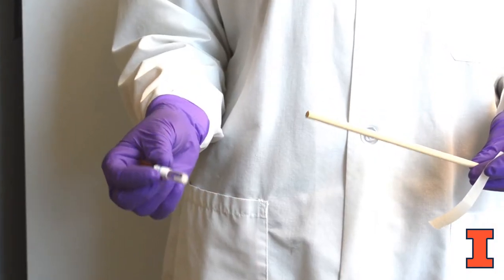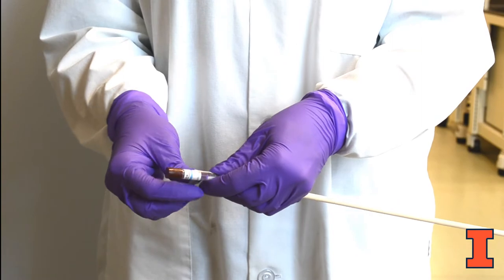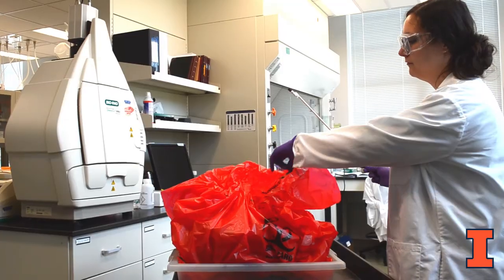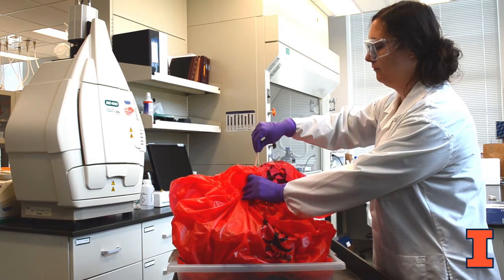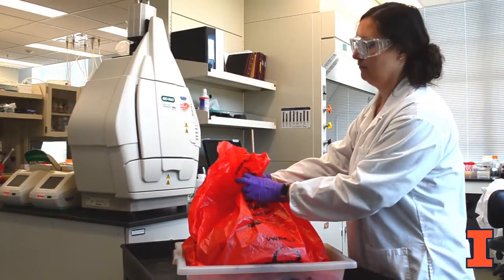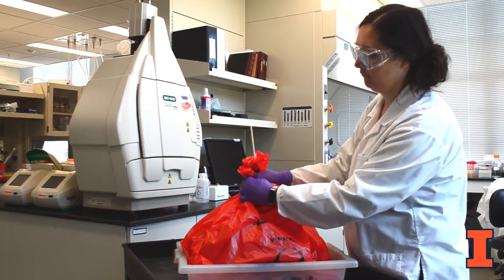Secure the spore vial to the end of the wooden dowel using autoclave tape or heavy duty lab tape. Do not cover the holes on the top of the vial. Position the end of the dowel rod with the taped spore vial into the center of the waste load, allowing the opposite end of the dowel rod to stick out of the bag. Close the bag around the end of the dowel rod for transport using regular tape, autoclave tape, or twist ties.